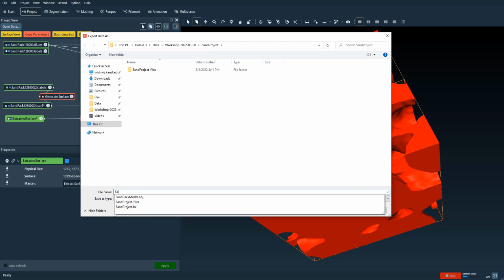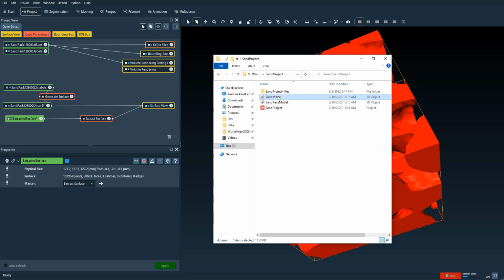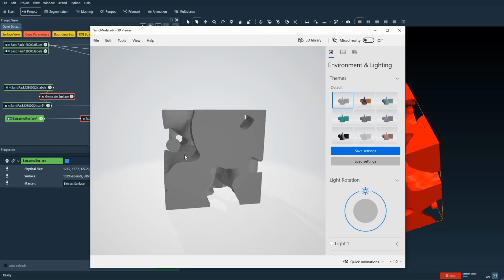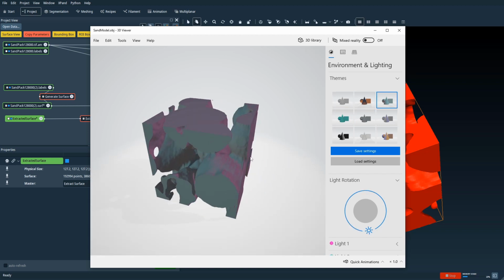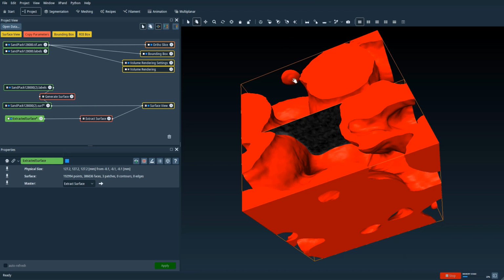And therefore, if you extract this particular model, so let's say we call this sand model and use the same format. Okay, this should now allow us to just load the mesh for the sand material, as you can see here. Okay, and so here you can also change the shading parameters, for instance. And later, we're going to use this extracted 3D model for visualizing our data in virtual reality using the Unity game engine.